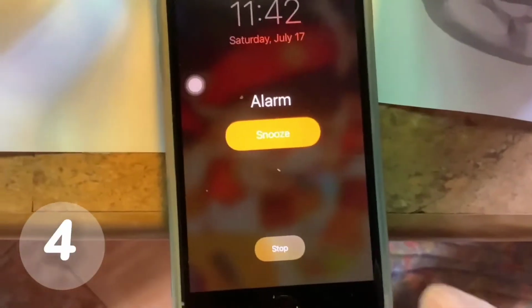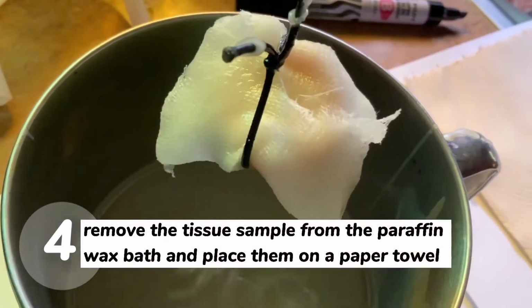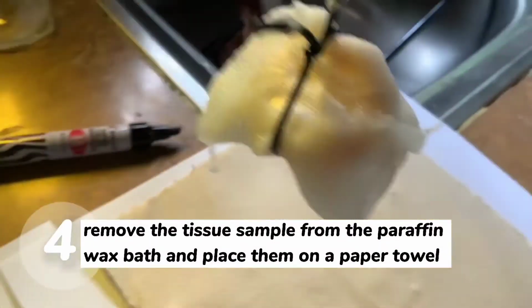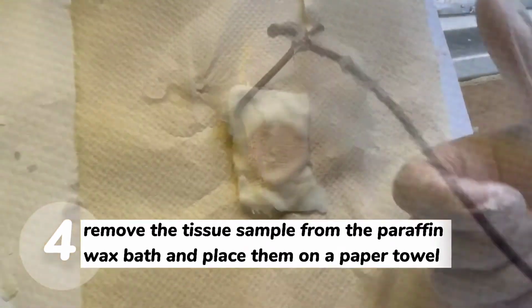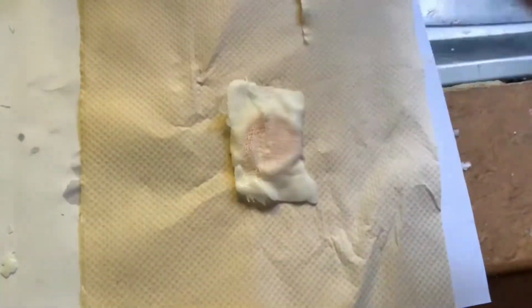When 45 minutes is done, remove the tissue sample from the paraffin wax bath and place it on a paper towel. And now, your tissue is ready for embedding. And that's it for the infiltration process.